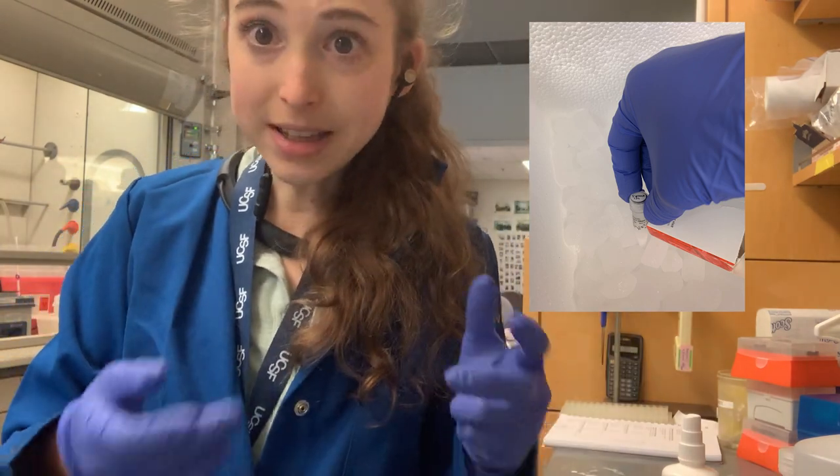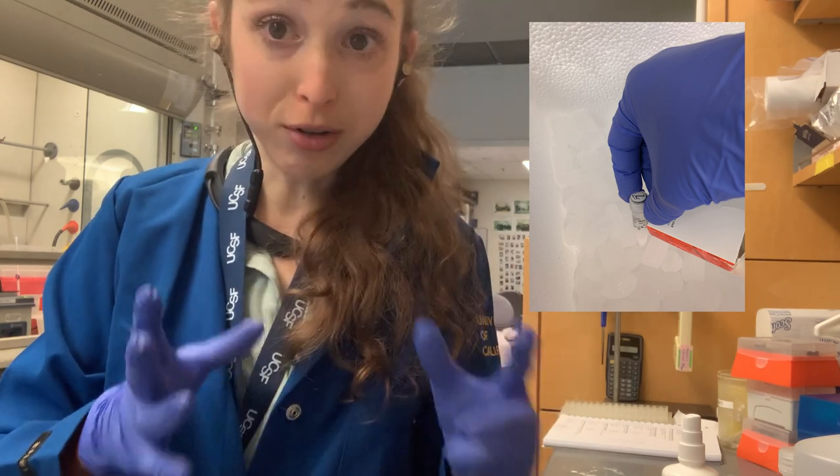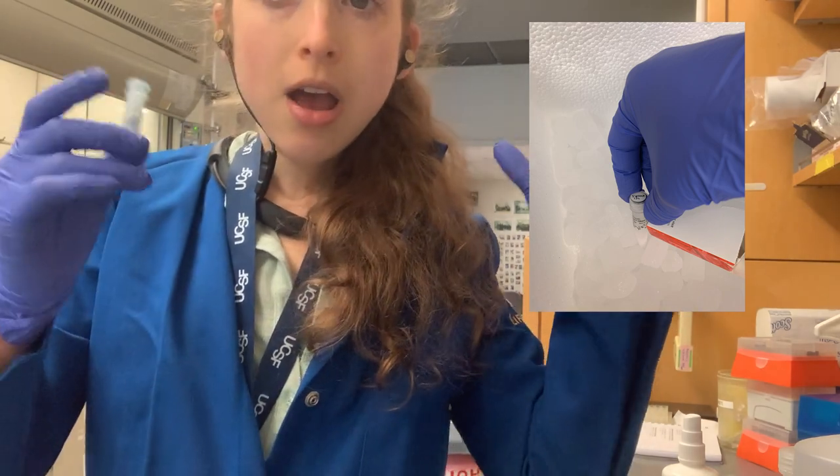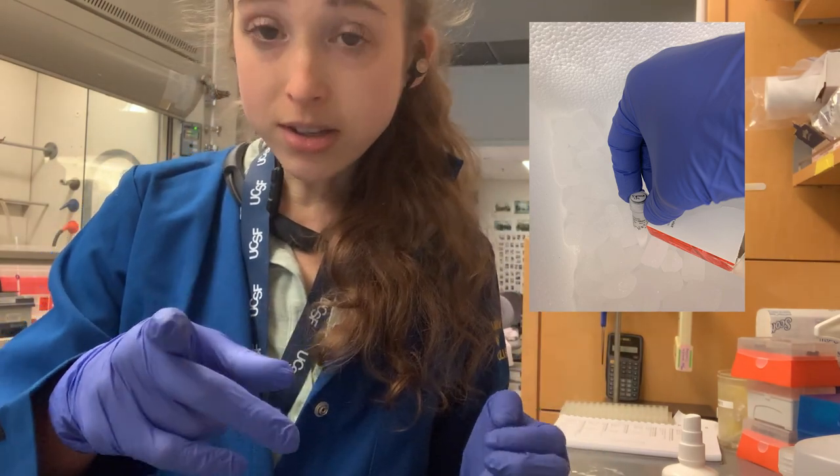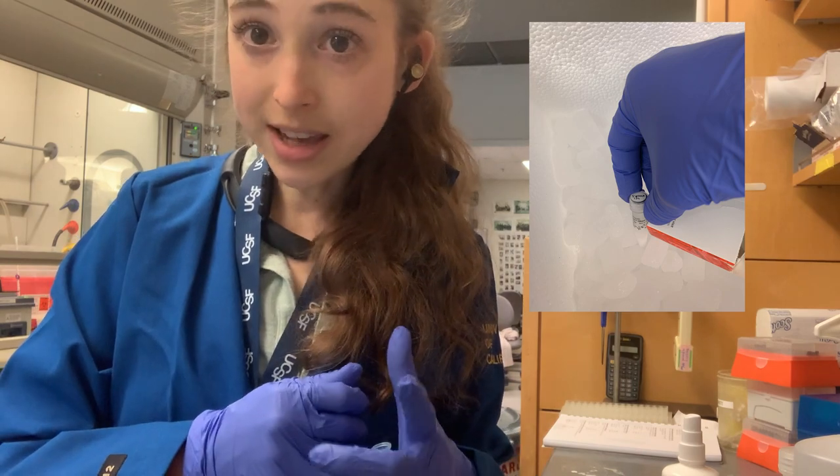Basically, it's important to label your tube tops and the sides of your tubes. There is an extra complication — one more thing while I'm on the topic of those tubes you might get in a kit.